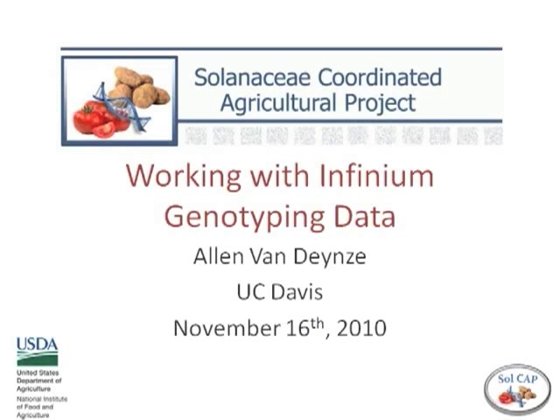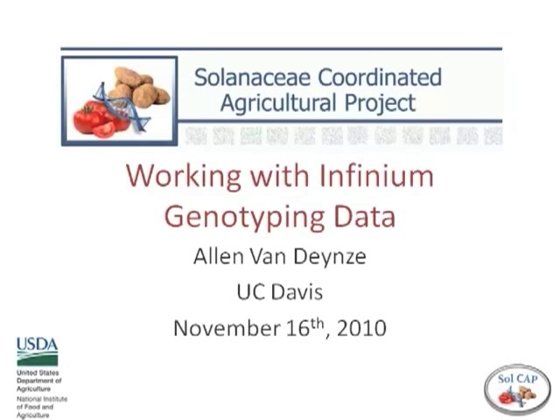Genome Studio is the software that Illumina puts out to analyze your data. So it's really how you call your SNPs from the raw data and types of things you need to export to look at and qualify how well that data, how good that data is or how good that genotype call is.